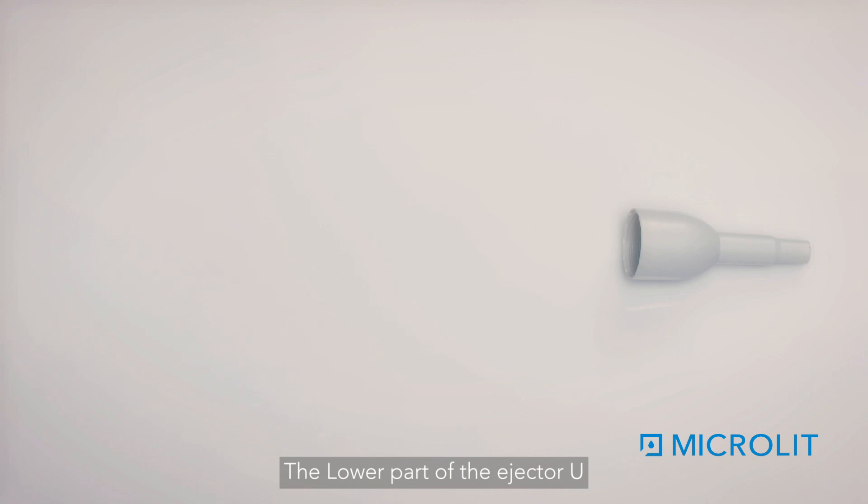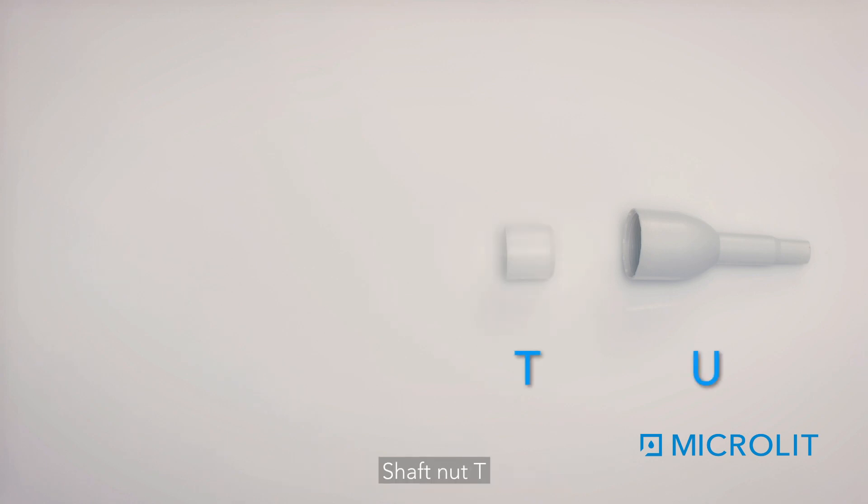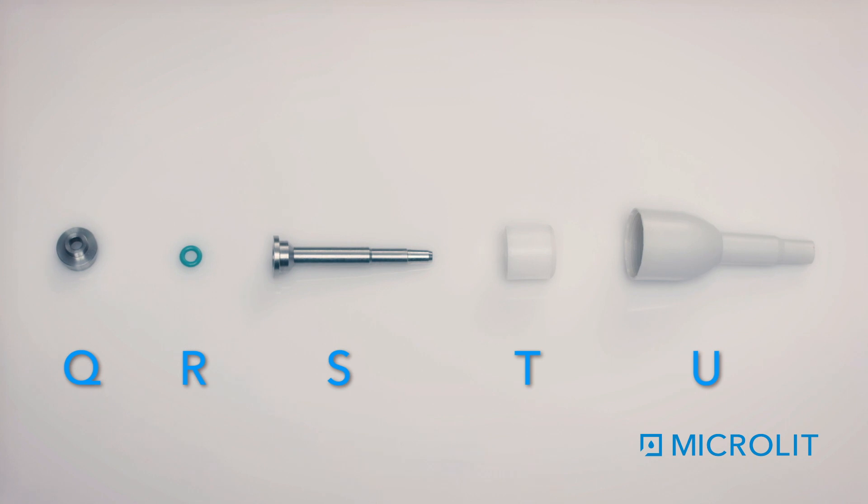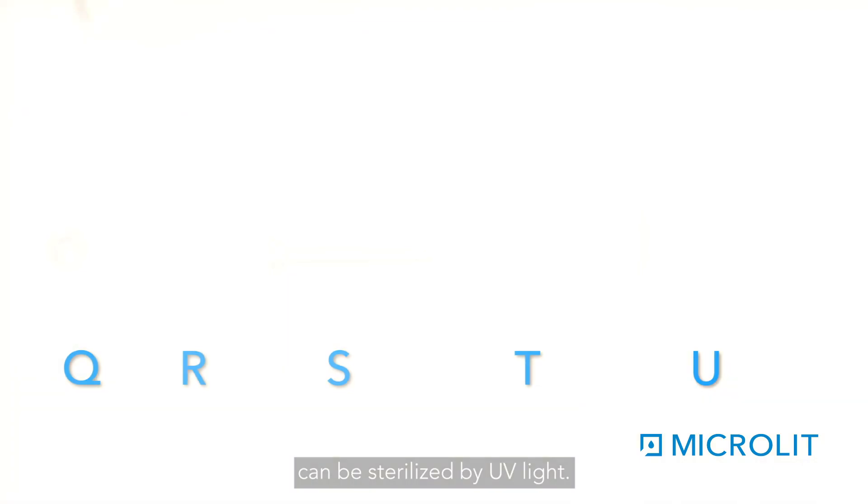The lower part of the ejector U, shaft nut T, shaft S, O-ring R, and piston unit Q are autoclavable at 121 degrees Celsius, one bar, for 20 minutes. The whole pipette can also be sterilized by UV light.